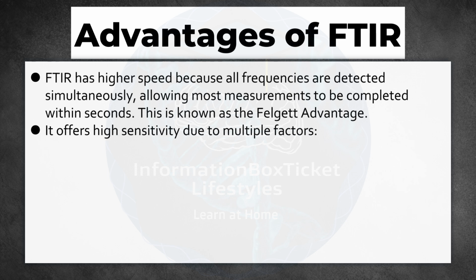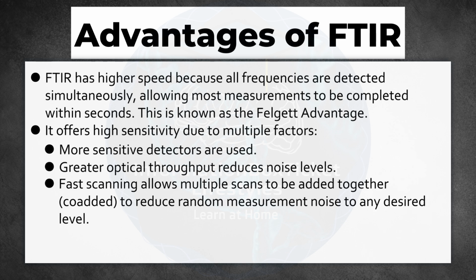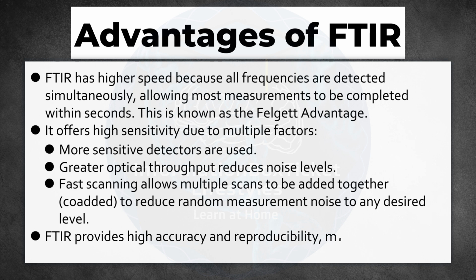It offers high sensitivity due to multiple factors. More sensitive detectors are used. Greater optical throughput reduces noise levels. Fast scanning allows multiple scans to be added together, co-added, to reduce random measurement noise to any desired level.